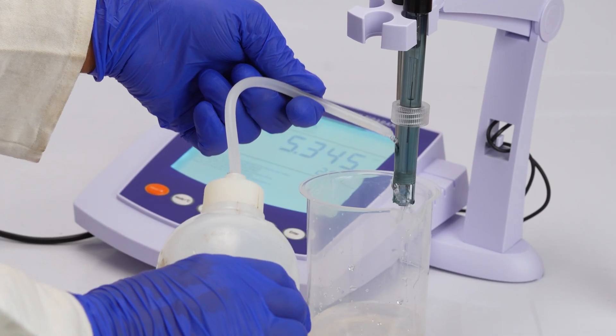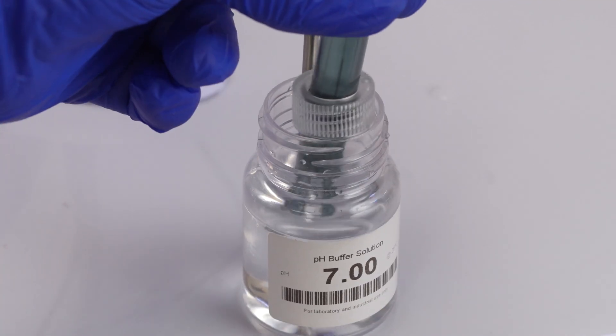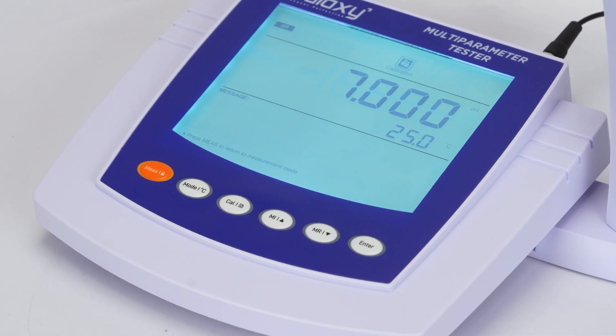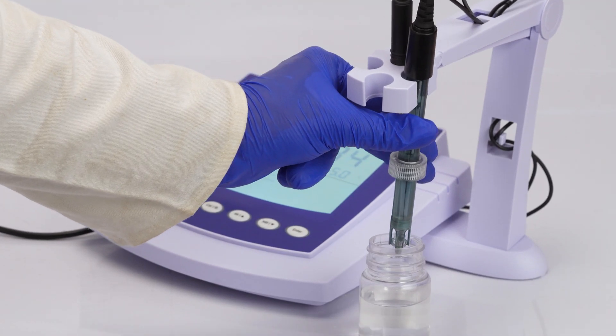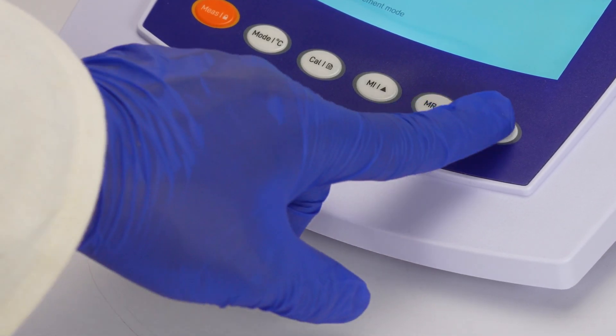Rinse the electrode and immerse it in the first buffer at pH 7, then press enter. When cal two displays, rinse the electrode and immerse it in the second buffer at pH 4.01, then press enter.